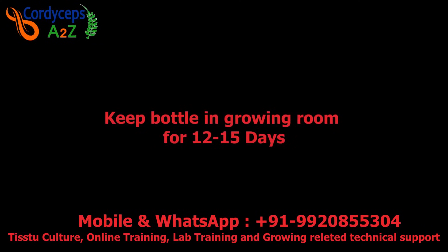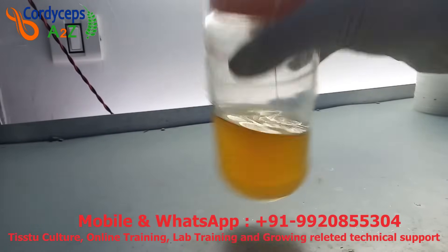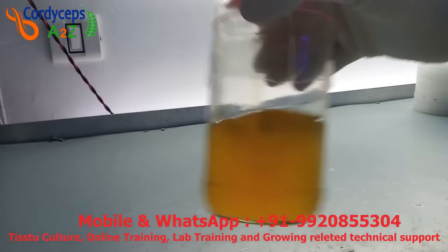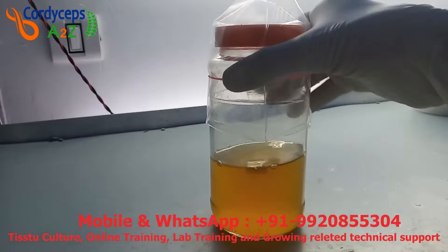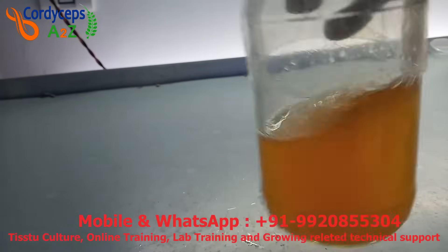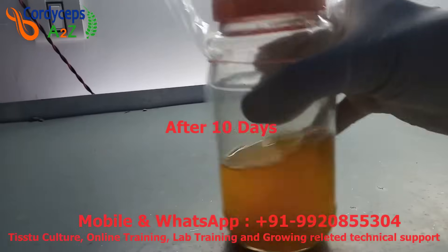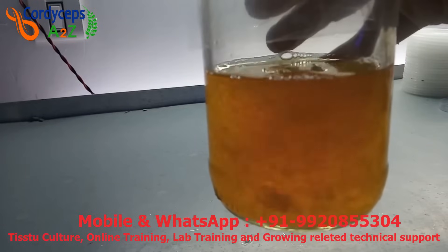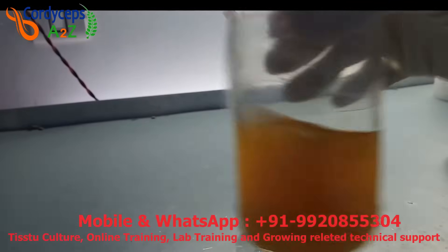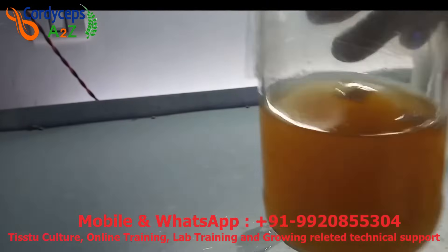Keep this bottle in the growing room and maintain 20 degrees Celsius. Rotate it 10 to 12 times every 3 to 4 hours — in this way the liquid tissue culture will be ready in a maximum of 12 to 15 days without a rotary shaker. With a rotary shaker it will be ready in 4 to 5 days. On day five, small fibers have started forming in the liquid. On day ten, the quantity of fibers has almost doubled. On day fifteen, the liquid is completely filled with fibers — this is the kind of liquid tissue culture we need, and it is ready for use.